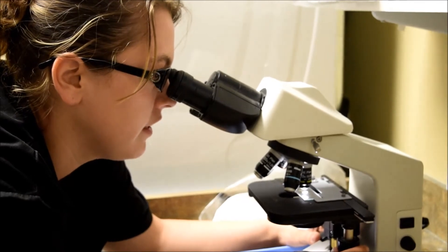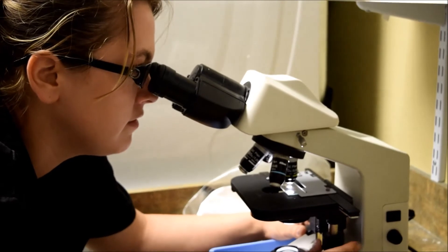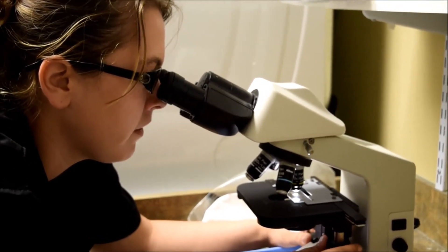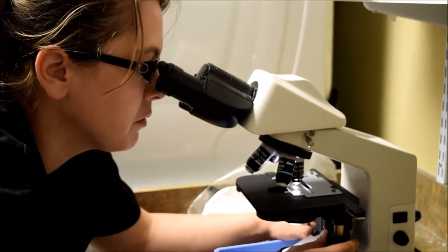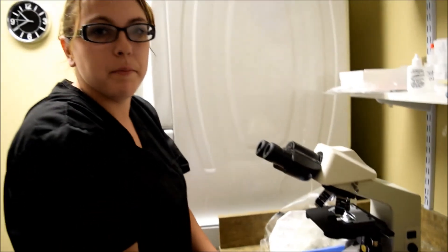Just checking the entire slide to be sure that we are ear mite free. The sample had the coffee ground texture that we look for when we see ear mites, but this kitty does not have ear mites.